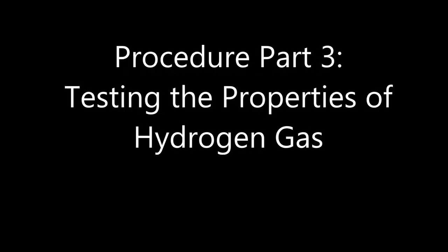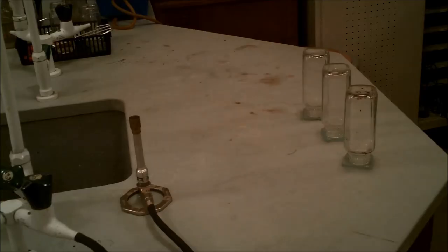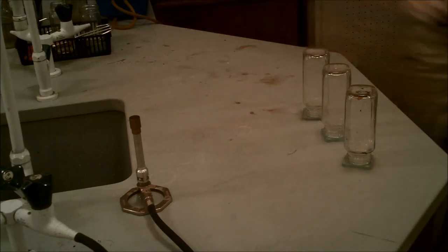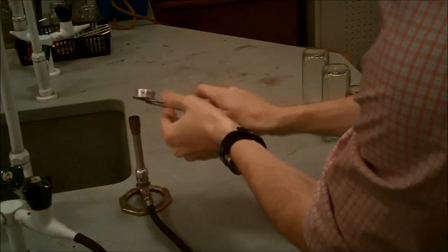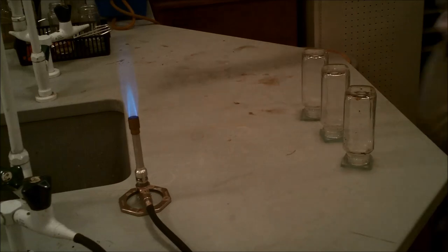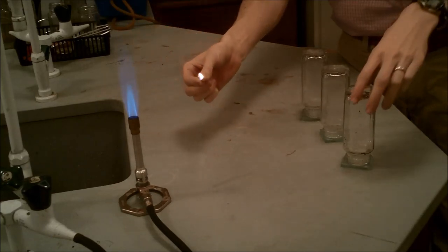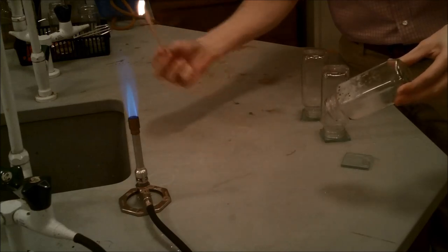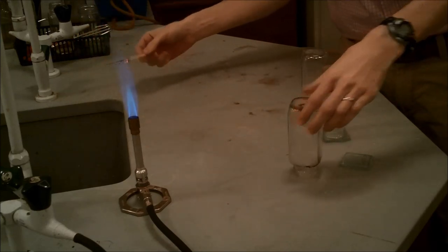Now for the really fun part, the testing of the hydrogen gas. So at this point we have three jars on our lab bench that are all filled with hydrogen gas. Of course we wear our safety goggles. The first test, we'll take a jar and we'll take a burning splint and put the burning splint in the jar once and see what happens. Then take it out and put the burning splint back in a second time in the same jar to see what happens as well. We're going to use the Bunsen burner as a way to light our splints so we can get our burning splint. A burning splint is just a piece of wood that's on fire. So it's like a popsicle stick where an end of it is on fire. So here we go. Here's the first test. Make sure you listen well. And then the second time. And that is test number one. That first jar will now be rinsed and cleaned and ready to use for the second test.